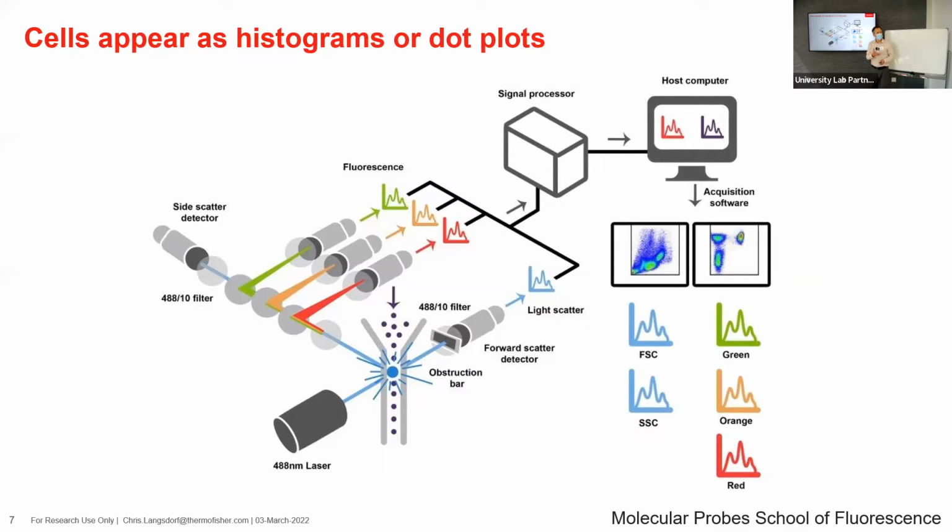So like I think in the organ on a chip model, you might be looking at cells that express 1 or 2 given markers, and that identifies them as fibroblasts or myocytes or something like that. So we could have, for example, a fibroblast marker here, a myocyte marker here, or a neuron marker here, and we can identify different cell types based on the markers that are present, like the protein antigen markers on the surface of cells.